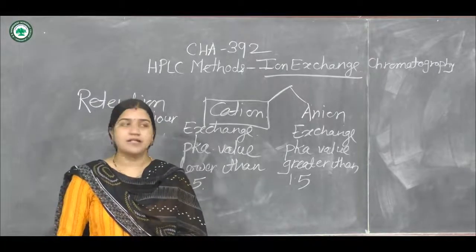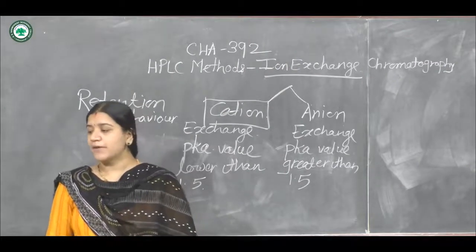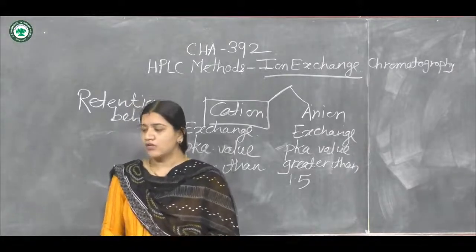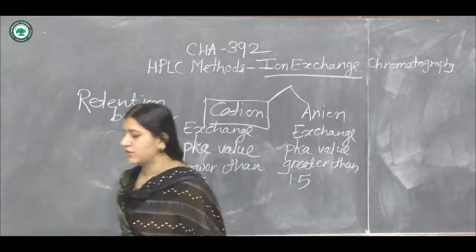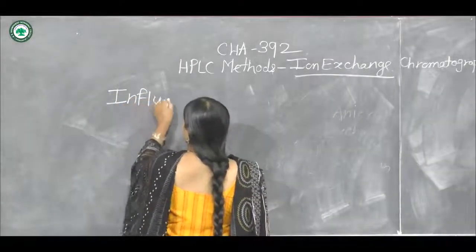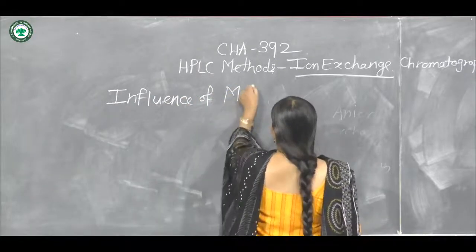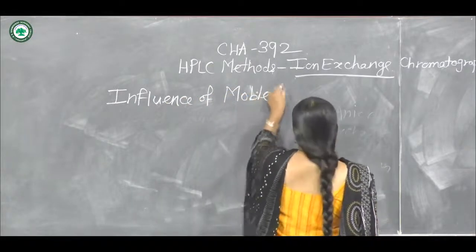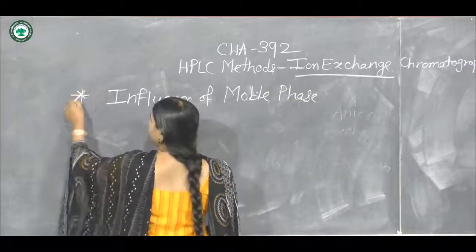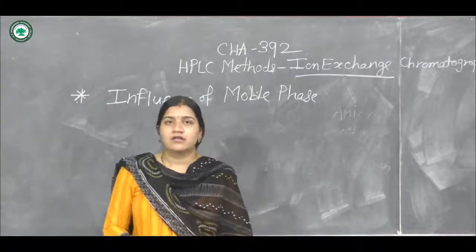Now the next part is the influence of the mobile phase on ion exchange chromatography.